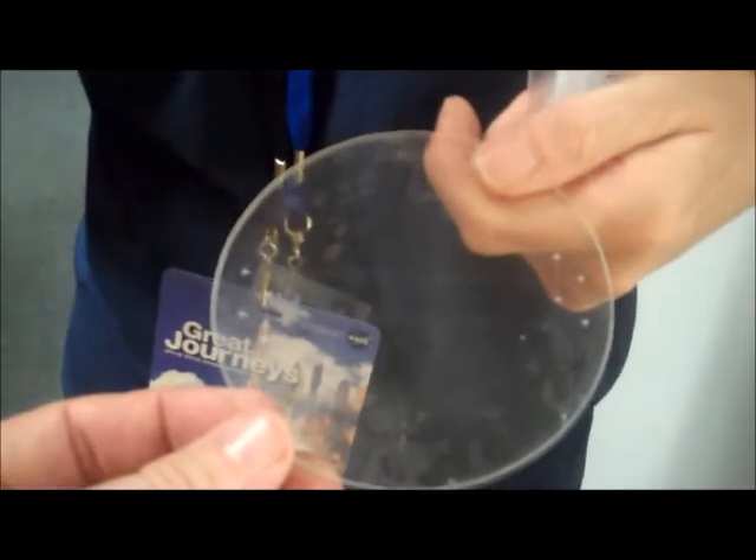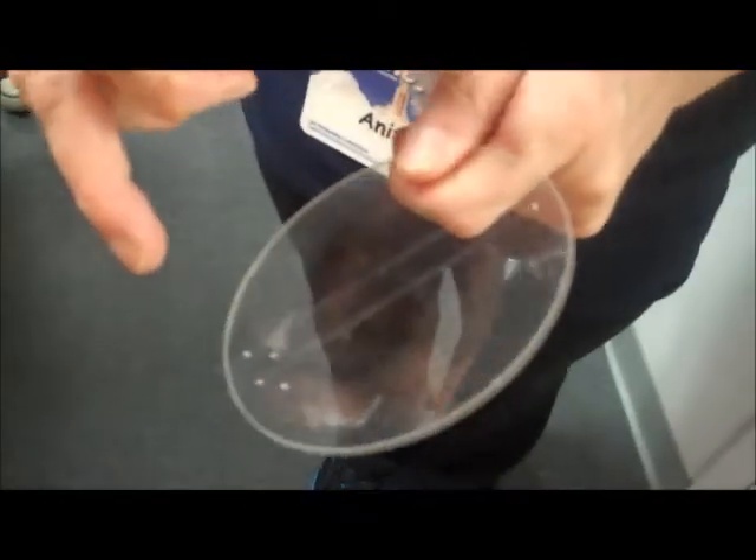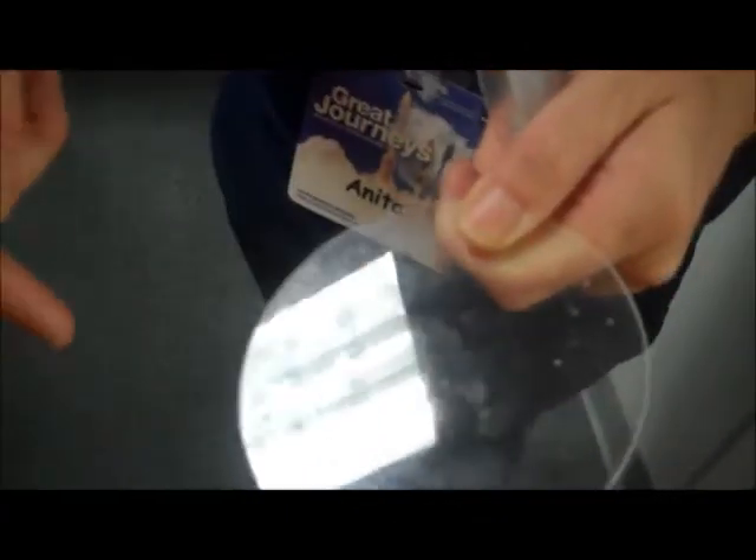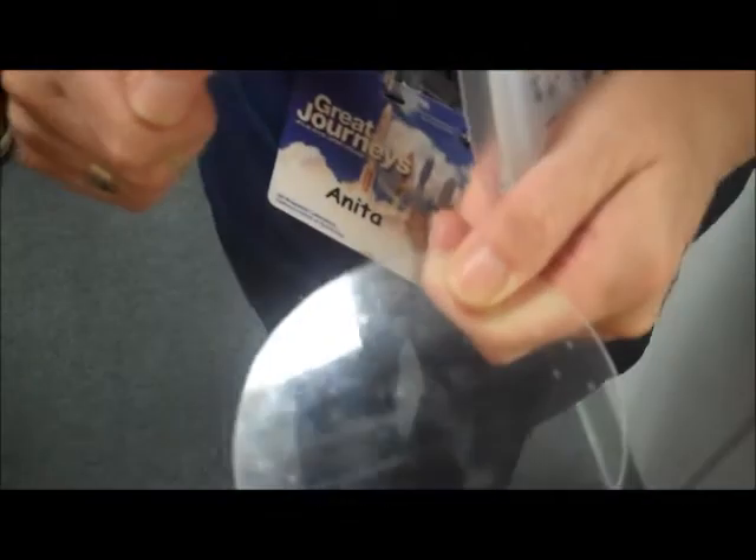A micron is a millionth of a meter. That's how wide it is and the sample is flowing through. It's called electrophoresis because you're putting electric current across it. Anything with electric charge, like amino acids or salts, will flow along — in one end and out the other. And as it's flowing, we're going to detect what's inside that sample.